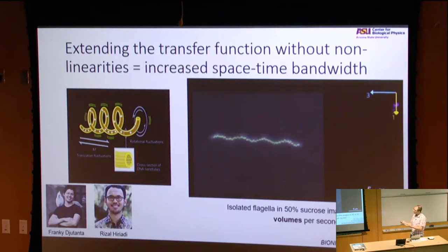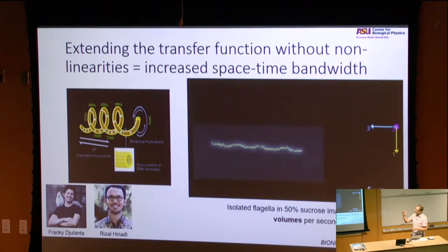So how do we generate such fast scans? We introduced a galvo mirror and we put it conjugate. And so what we're able to do is remotely move the light sheet, which also remotely moves the image plane. So it's both scanning and descanning the fluorescence. With this, we can non-mechanically scan and basically go as fast as the photons allow us to go.